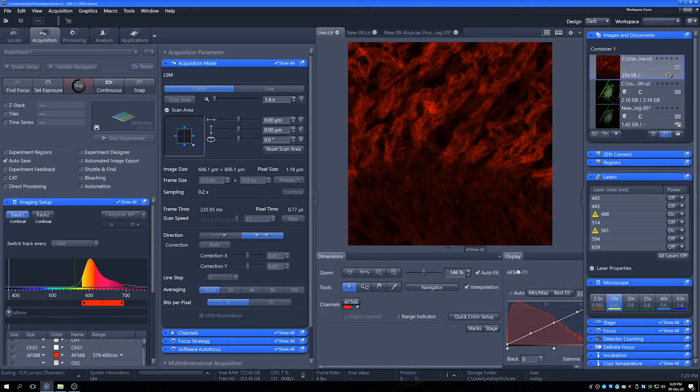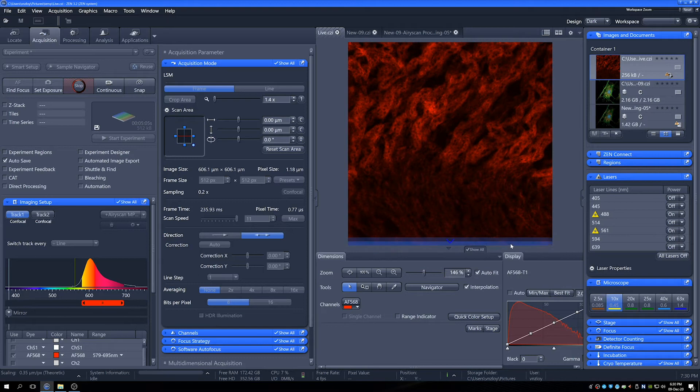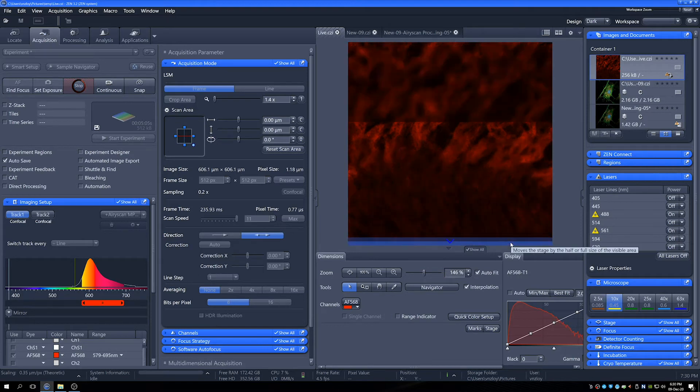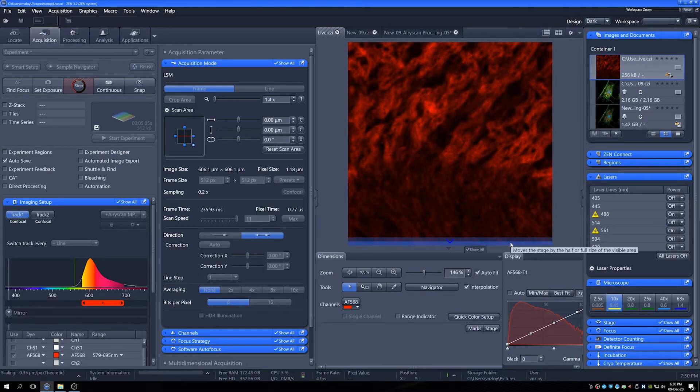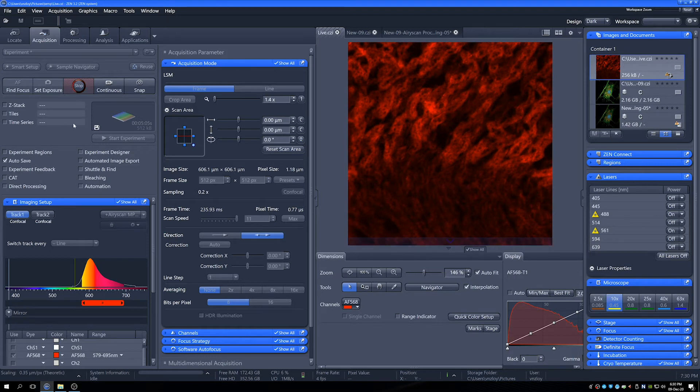So we can see some rat kidney. Beautiful. Just check where our focus is somewhere like that roughly.